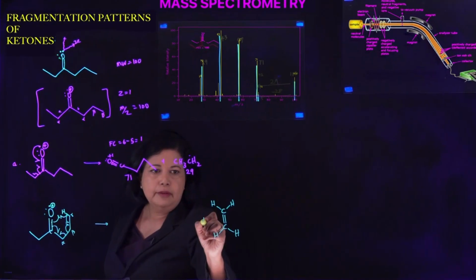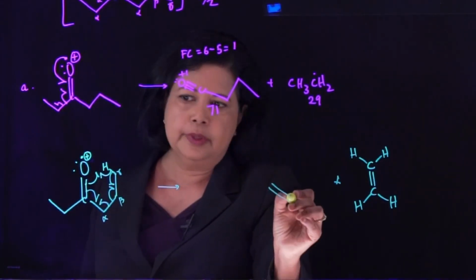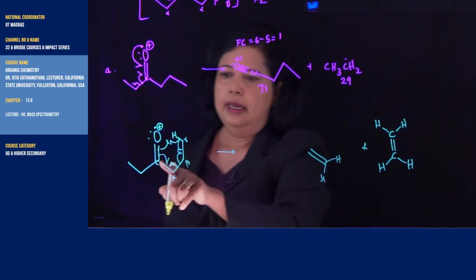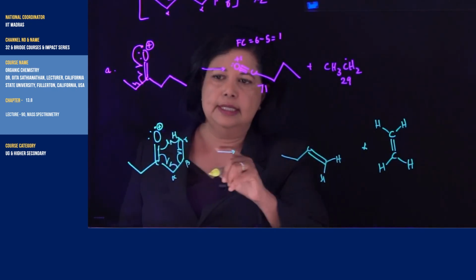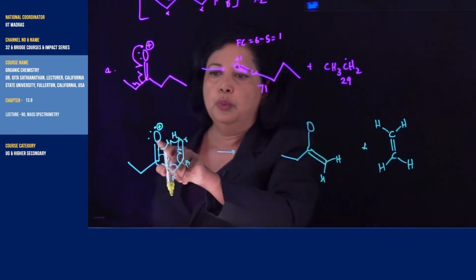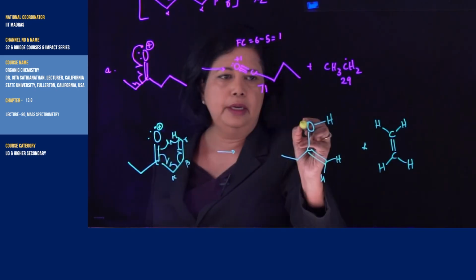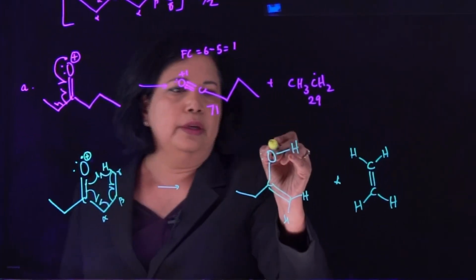So what do we have remaining here? You have a double bond right there. Remember, there are 2 hydrogens here, so those are going to be sticking around. And here's your tail on the other side. This is now a single bond oxygen bonded to a hydrogen, and you have a lone pair here, and a radical here.